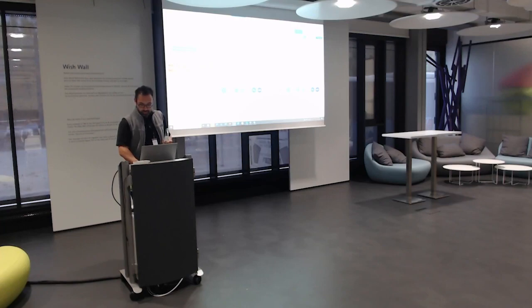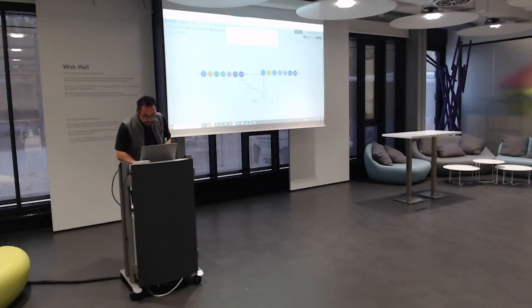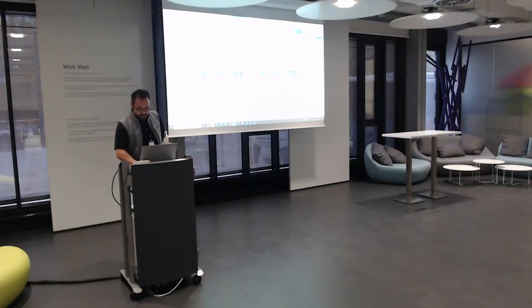If you need to expand it, it works as in Canva Desktop, right? Expanding the label will give you that, and we are working on fixing the actual display and the cleaning up of the biopolymer.